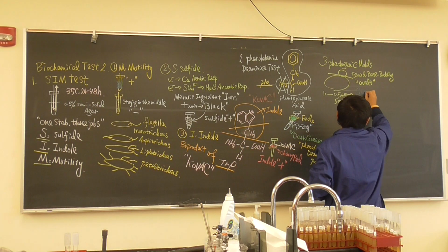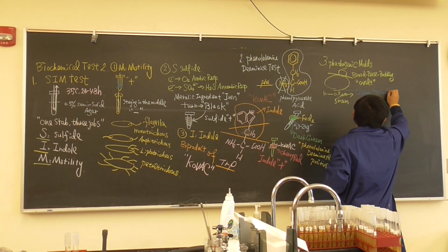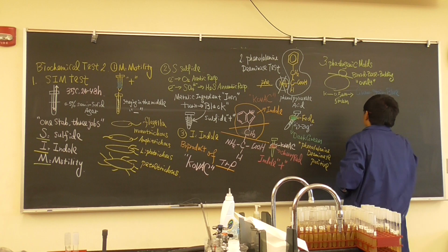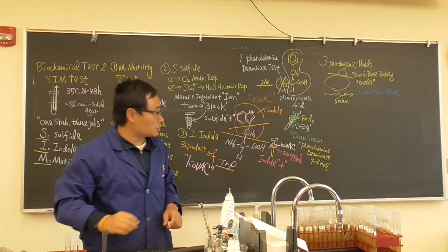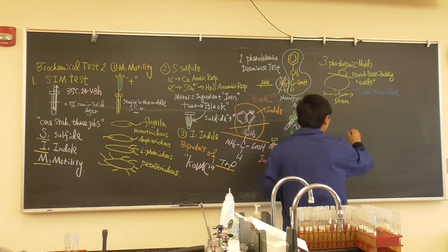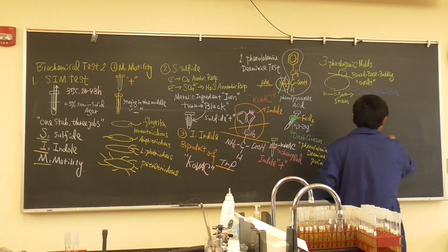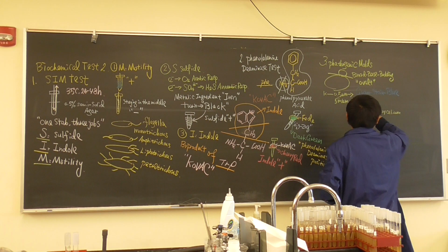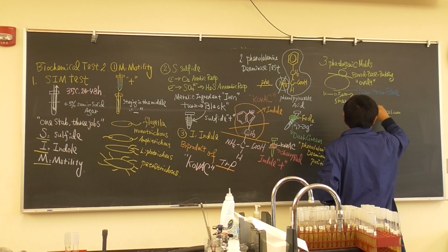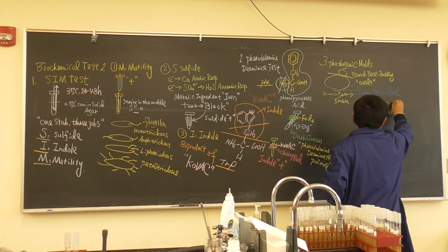We also call it Gram stain blue, not saying positive or negative. And then most of the time the structure looks very heavy, fuzzy at the bottom. We call it mycelium. And then you're gonna have these things come out, like a flower, like seeds, and they're gonna be released.